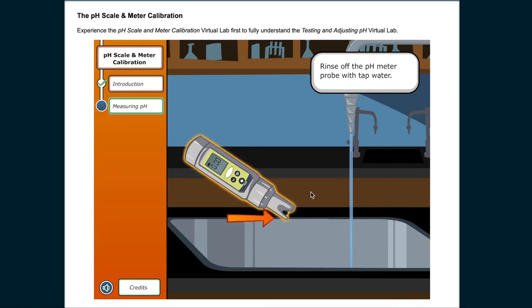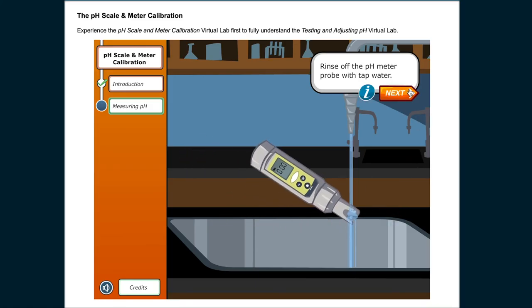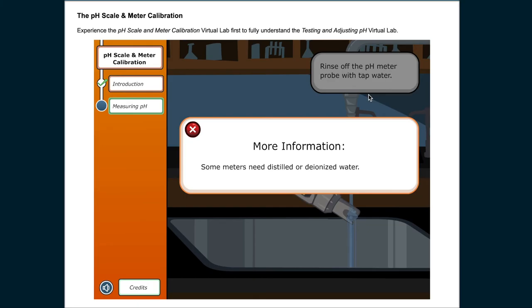Rinse off the pH meter probe with tap water. Some meters need distilled or deionized water.